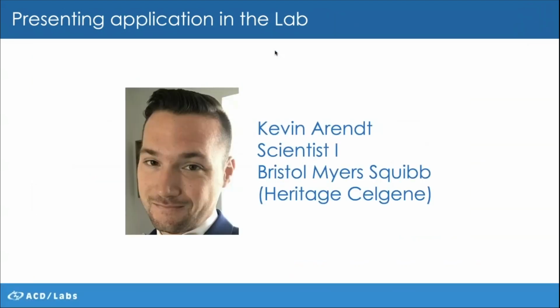So at this point, it might be good to transition to Kevin and have Kevin describe the utilization of Katalyst in the lab and Kevin's day job and how scientists at Celgene and now BMS are using the application today. Kevin, over to you. All right, thank you, Andrew.